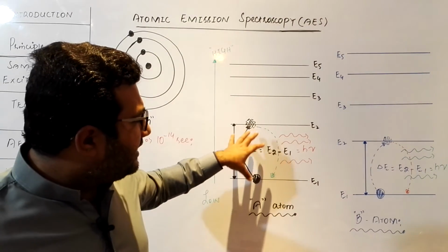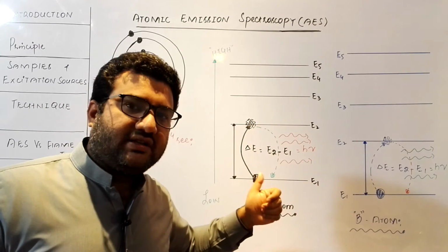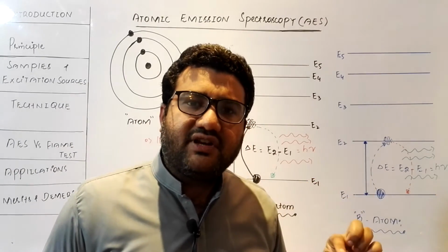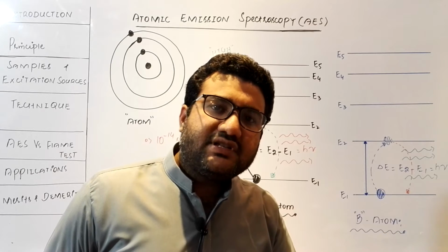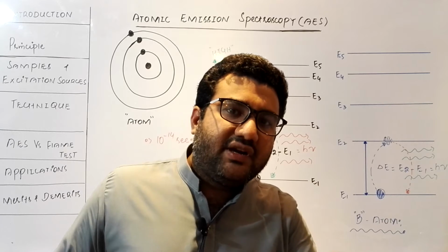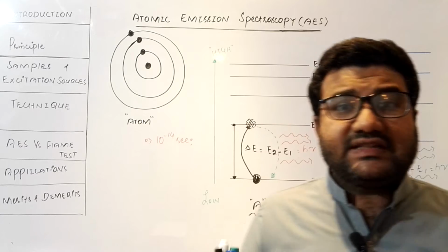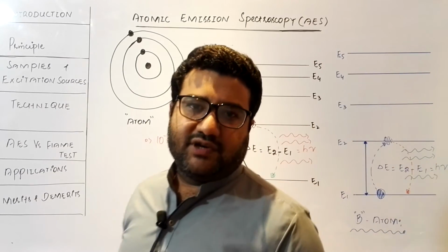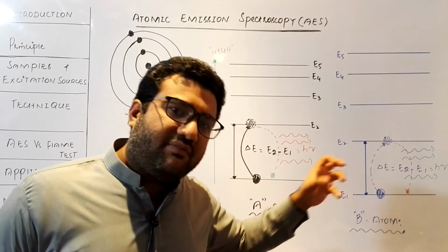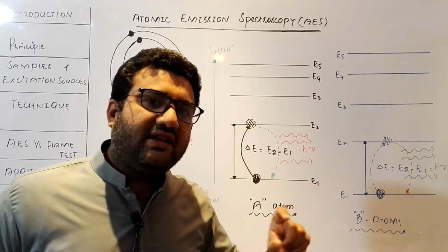When both these electrons were excited, they absorbed photons of different energy. And when they are de-excited, according to the law of conservation of energy, they will release photons of the same energy. So when the energy absorbed was different, the energy emitted will also be different. This is the base, the principle of atomic emission spectroscopy, that when the electrons are excited in different atoms, they absorb different amounts of energy, and when the electrons are de-excited, they release different amounts of energy.